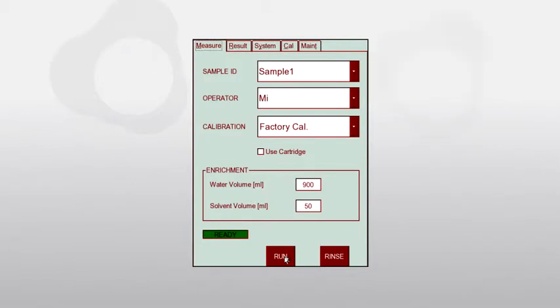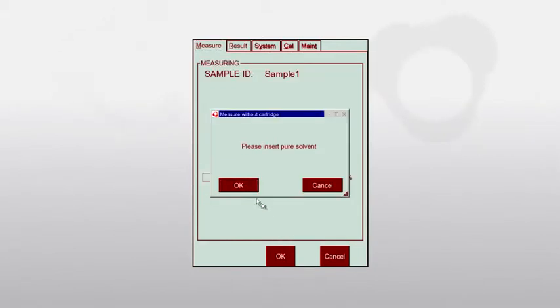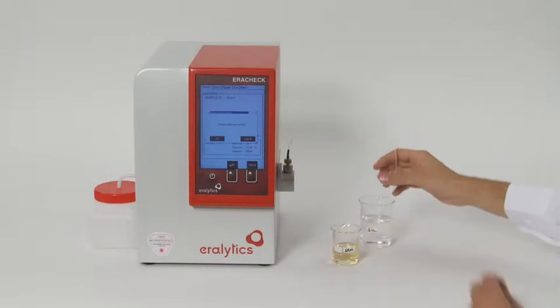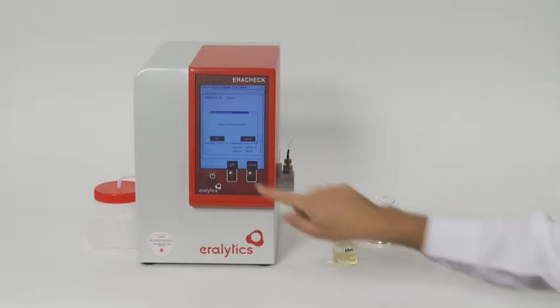To measure the total oil and grease concentration, select factory calibration or your own customized calibration and press Run. First you will be asked to insert pure solvent. Please make sure to take the pure solvent from the same solvent batch as the one used for the actual extraction.